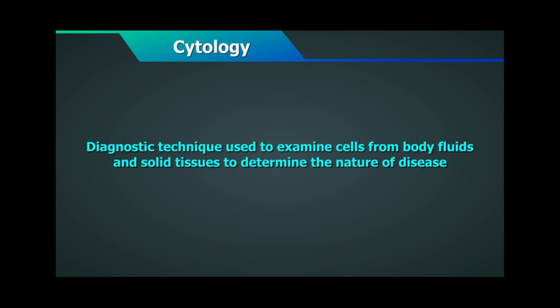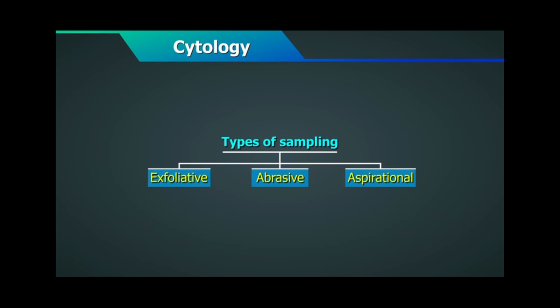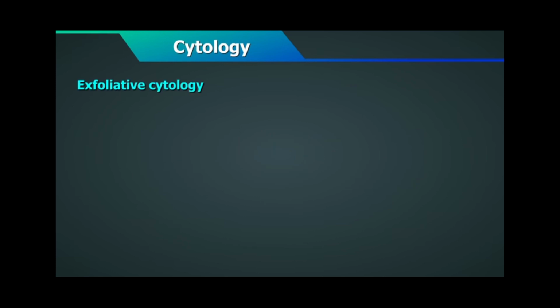Diagnostic cytology simply means microscopic examination of cells from different body sites for diagnostic purposes. Diagnostic cytology includes exfoliative, abrasive, and aspirational. But for today, let's focus on exfoliative cytology. It deals with the microscopic study of cells that have been desquamated from epithelial surfaces.